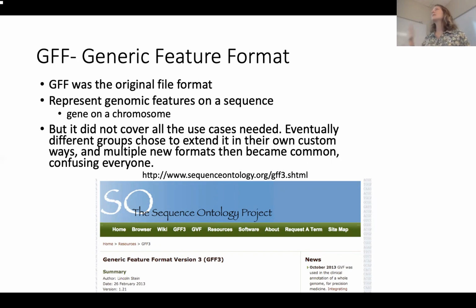So the big problem with this format, as I was saying earlier with FASTQ and FASTA, those are really hard standards that the whole world has adopted. Everybody's behind them. Everybody agrees on what they should look like. If you get a file from Japan or Europe or Illumina or PacBio, it is largely going to be formatted the way you expect. GFF is more the wild, wild west.